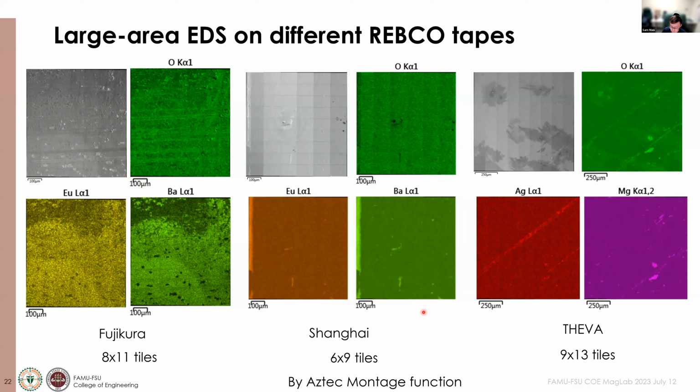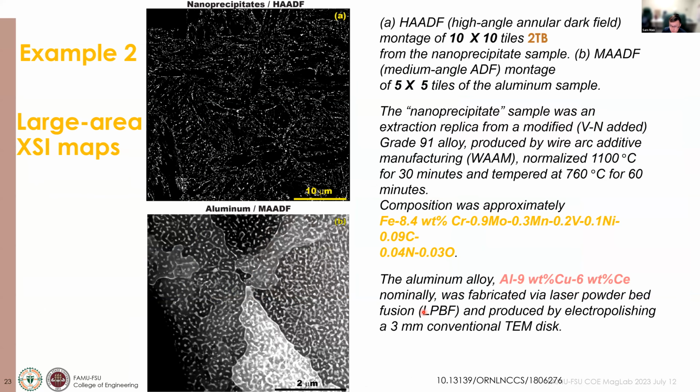This is a kind of generic idea, but depending on the data cube, you can easily extract these maps with greater confidence. I'm going to show you a very interesting demonstration here. What I'm trying to show you are 2 different systems, again using this large scale tile mapping.